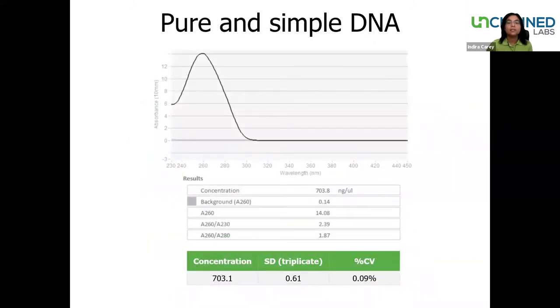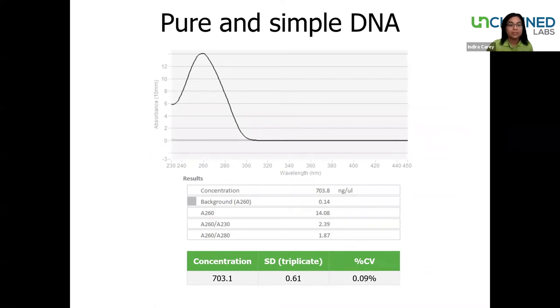Here we're looking at results from a sample of high-quality calf thymus DNA in TE buffer — a typical result for a clean sample. You can see the expected peak maximum at 260 nanometers, and the quality ratios are within an acceptable range. Note also the accuracy and reproducibility — we're seeing nice low standard deviations and coefficient of variation readouts for triplicate reads.